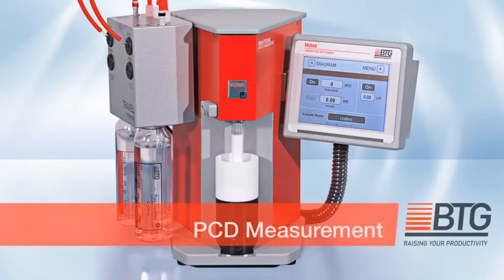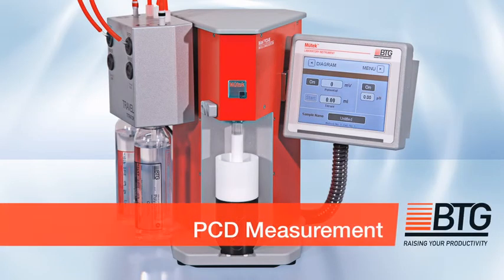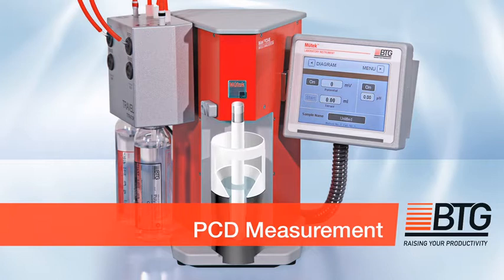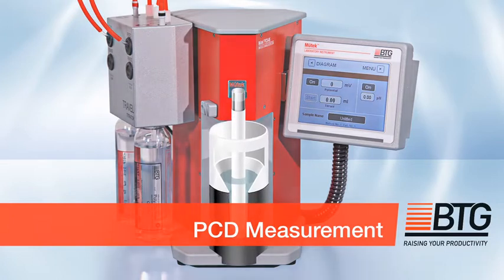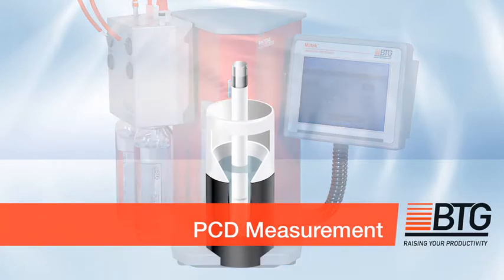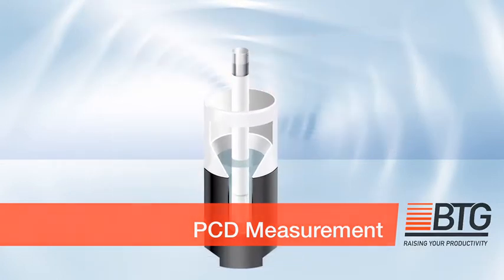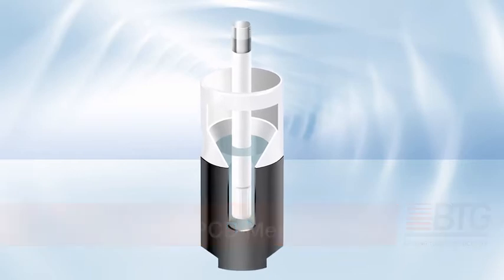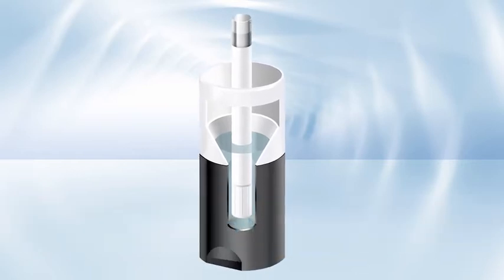This is the measuring cell of the particle charge detector. It contains a sample vessel and a displacement piston. Both items are made of PTFE.